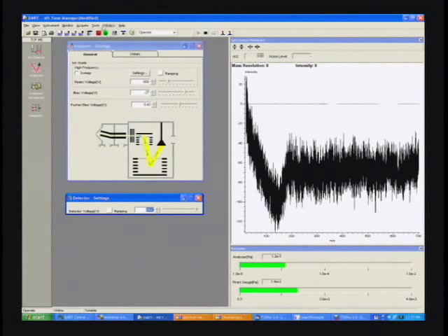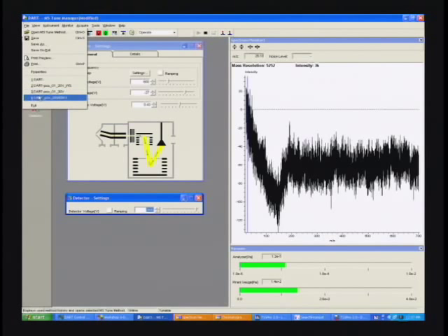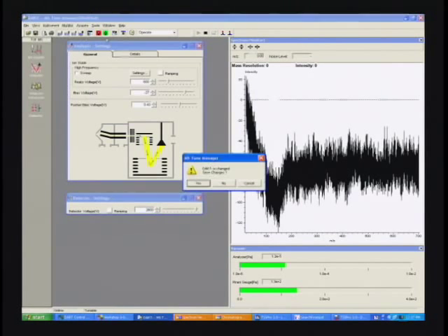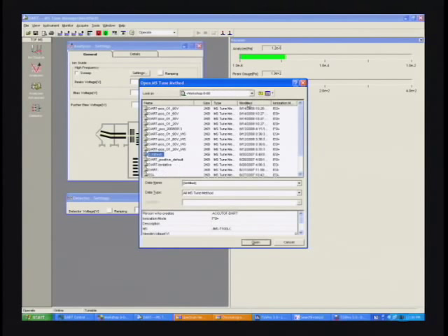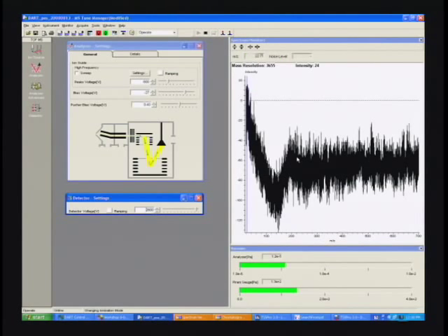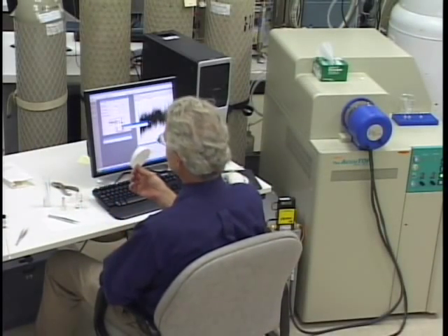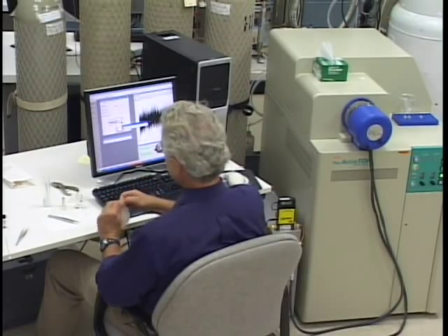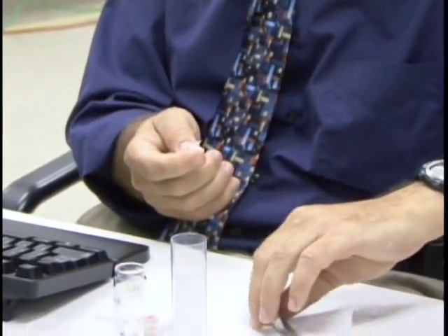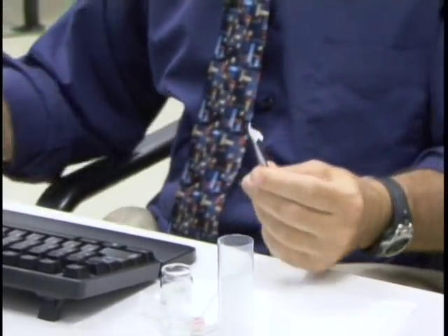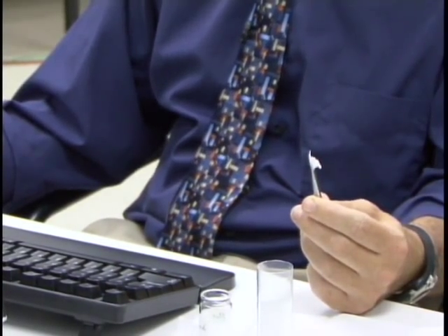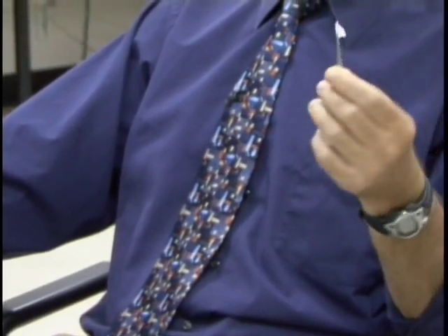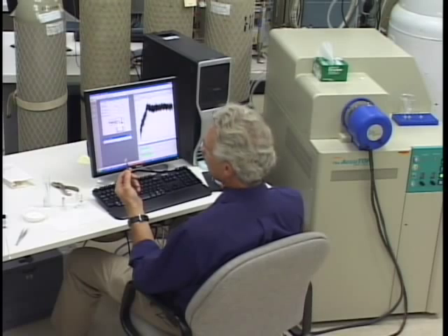Now let's go back to something different. Let's go back to positive ion mode. Let's open a positive ion tune method, preferably a recent one. Now we're going to look at materials. I want to look at a piece of plastic from a coffee cup. Let's see if we can identify what kind of plastic it is. So let's just rip a little bit of plastic off of there and stick that in front of the dart with some forceps. To do this, I'm going to heat the dart up to higher temperatures so that we're going to decompose the polymer.